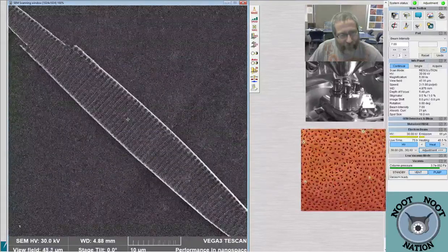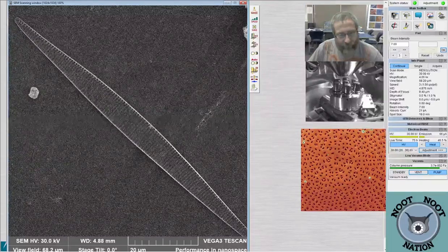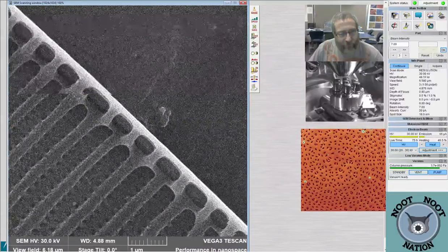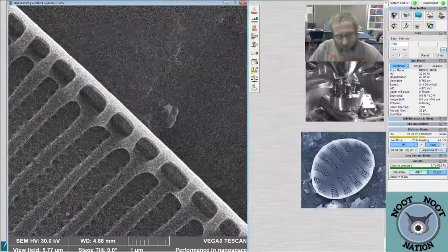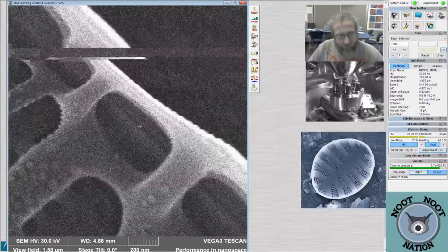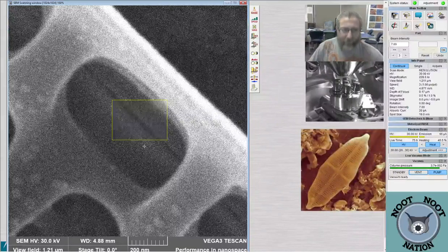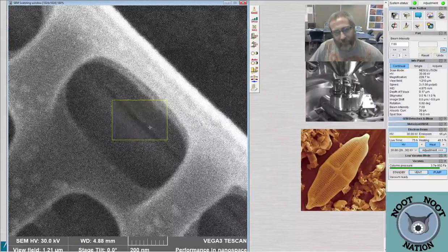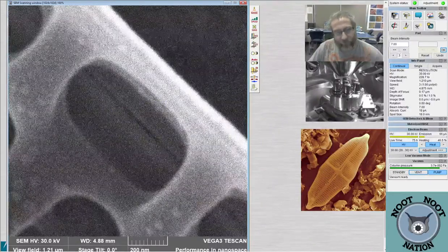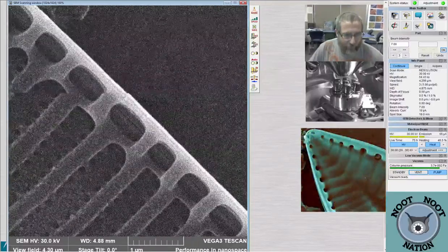Nice. Thank you. So the raphe goes along the raised edge that's at the upper side. Yep, it's on this one right here. You can actually see the channel the raphe sits in right there. In fact, the keel, we can see it right here, looking through this little window. Oh, it's tiny! Oh my gosh! That's the raphe right there, and it's just running inside that little window. This is the fibula, yeah. And so you can see the raphe through there.